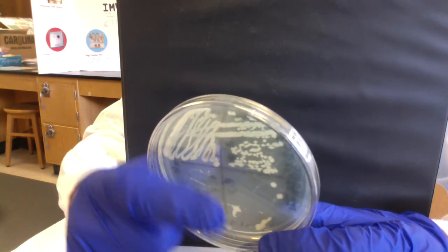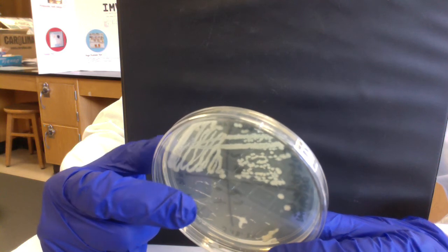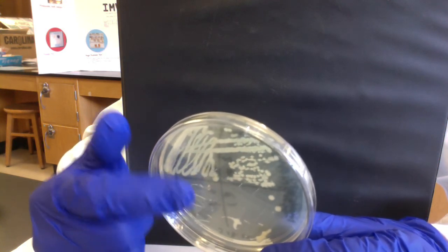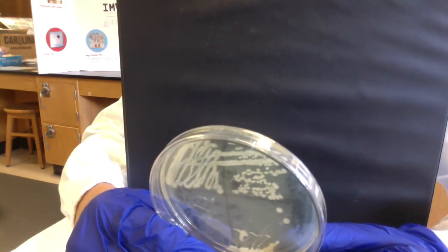On streak plates, it doesn't matter where you get the isolated colonies. In a clinical sample, there might not be many microbial pathogens present, so you might get isolated colonies even in quadrant one. It doesn't matter where you get them, as long as you get them.